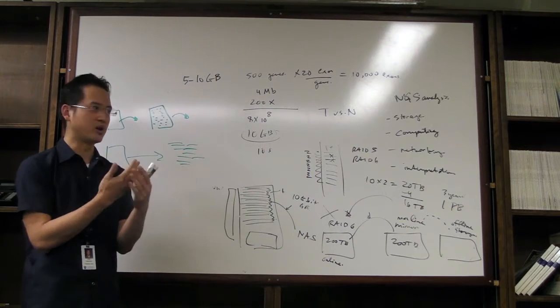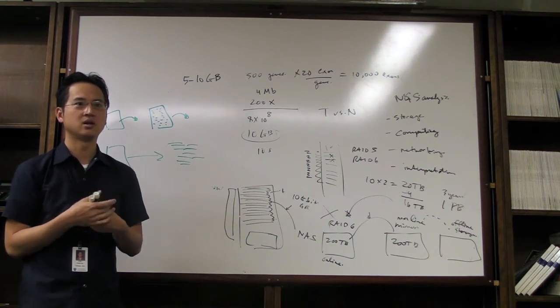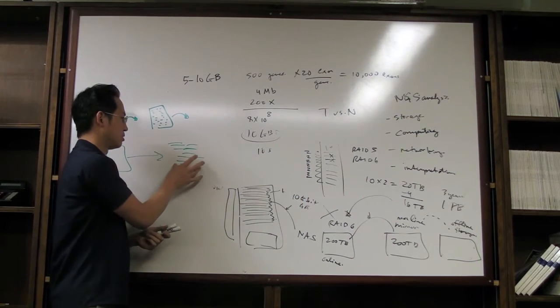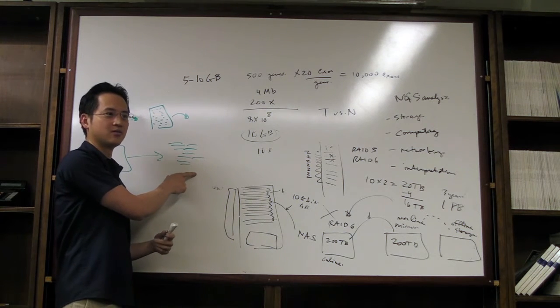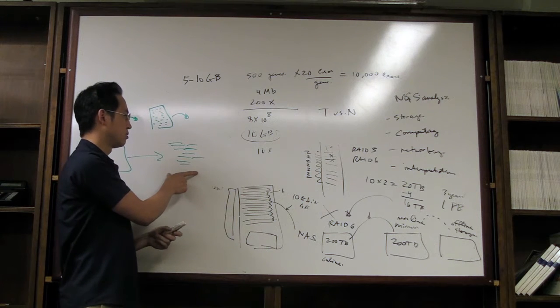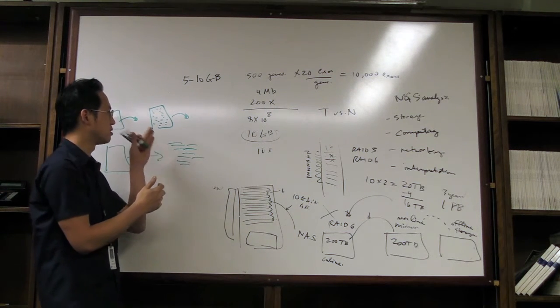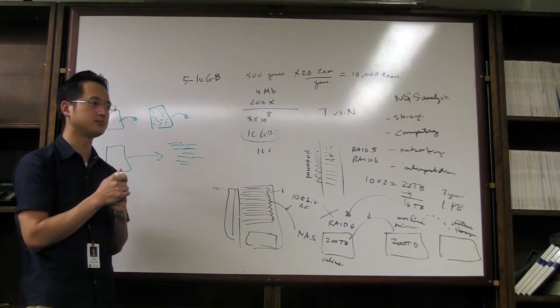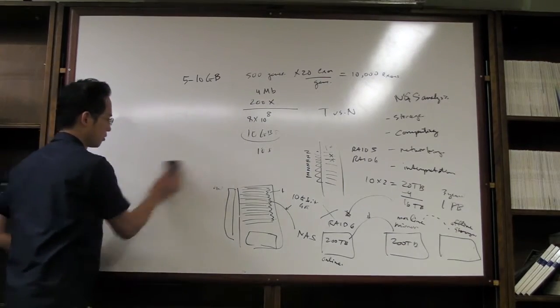We're not there yet with next-gen sequencing because it's not as automatic, but one day, hopefully, it'll all be built into one box, so that you get out the data. That's almost like point-of-care testing with next-gen sequencing. People are talking about this already, like with nanopore sequencing. But with the massive amount of data, nobody has quite a clear-cut solution yet. So that's all the infrastructure that is needed for computing.